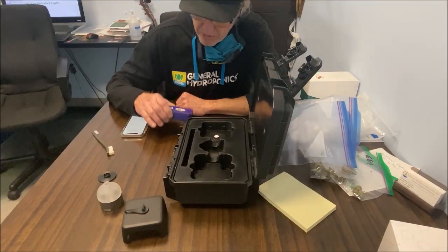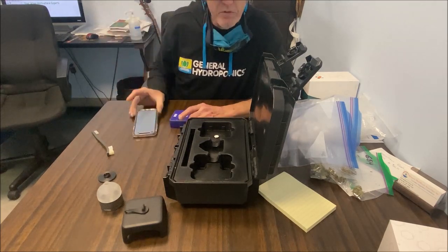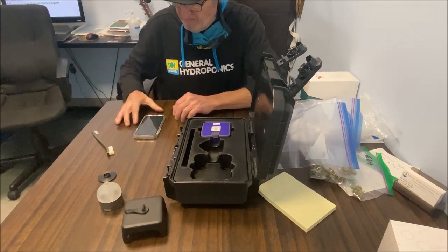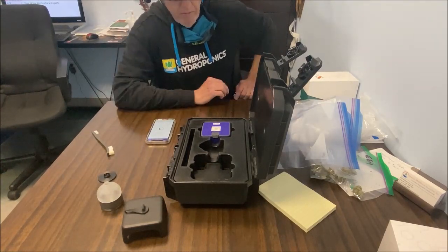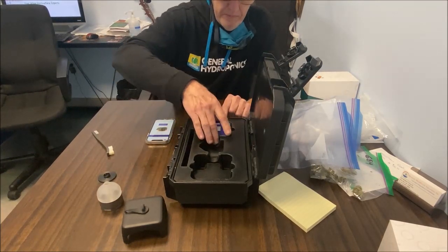Okay, so let's do some testing. I've got the unit all fired up. I've got my app opened up. The first thing that I'm going to do is calibrate the machine. There's a little white dot in here. I'm going to turn the machine upside down. I'm going to call up the calibration function on the app. Okay, so we're all logged in. Press the calibrate button. Okay, we're all calibrated, so let's go.